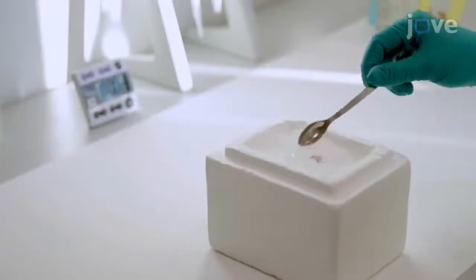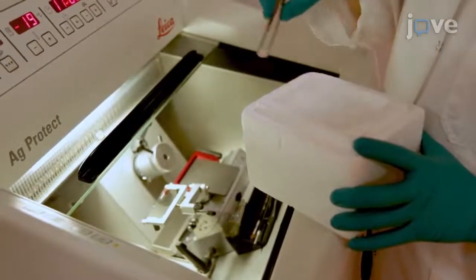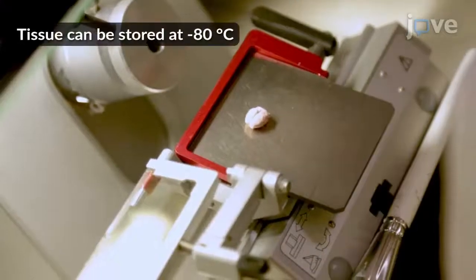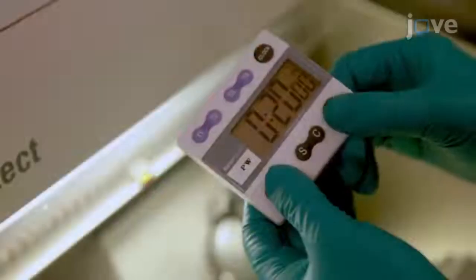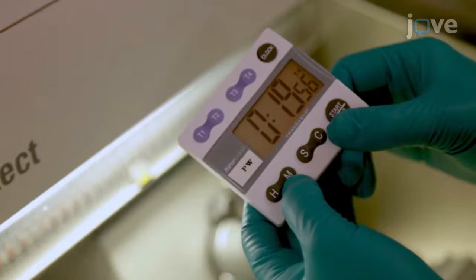To begin, submerge the tissue in powdered dry ice to snap-freeze it. Transfer the frozen tissue directly to a cryostat that is set to minus 20 degrees Celsius. Let the tissue acclimate to minus 20 degrees Celsius in the cryostat for 20 minutes.